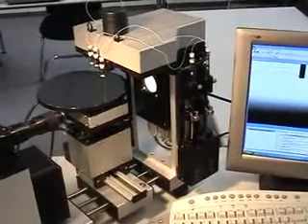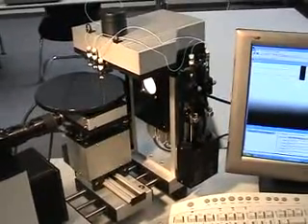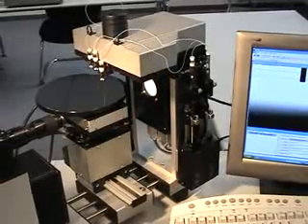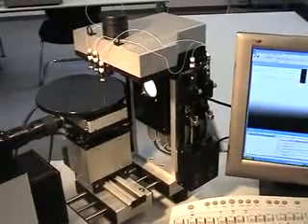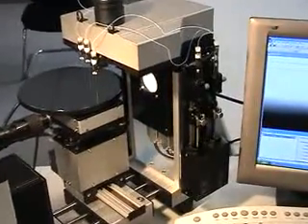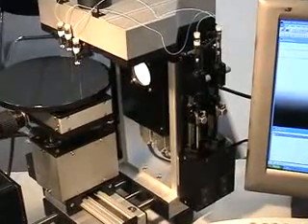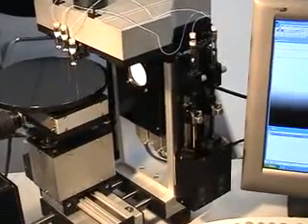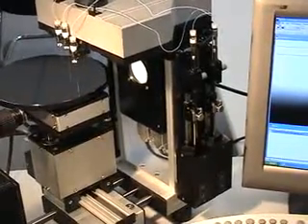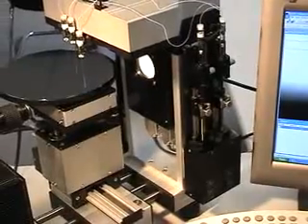For measuring surface energies we use typically different types of polar and non-polar liquids. Therefore we have attached to this unit here three electronic syringes.